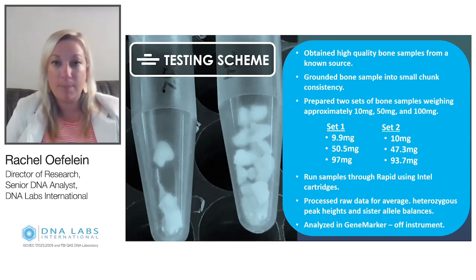So really we treat it like a brand new kit. We have our own analytical thresholds, our own stutter filters, our own stochastic threshold. And so moving forward into what we did with the bones is we obtained a high quality bone sample from a known source.